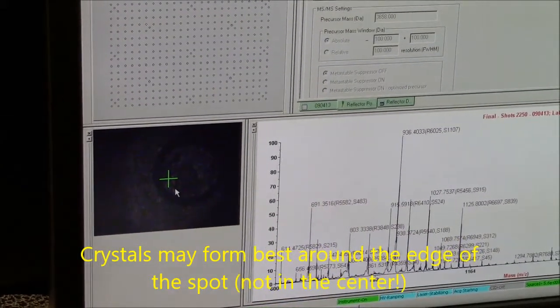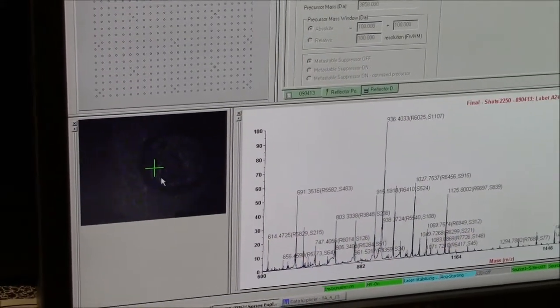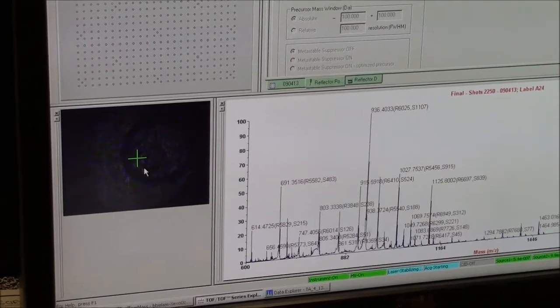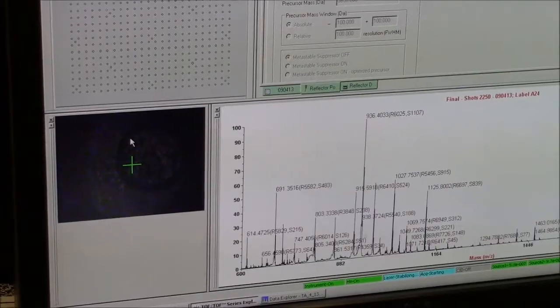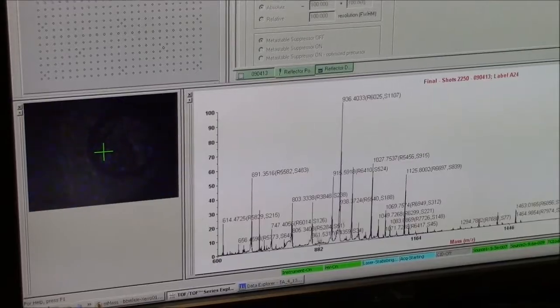DHB preferentially crystallizes around the edge. As anything's drying, you know that things tend to dry at the edge. So your analyte is probably concentrated at the nucleation sites of your crystals around the edge. So focus your target and your shooting at the crystals around the edge. You can move around the plate by double-clicking with the left click. Once it starts firing, you can see.